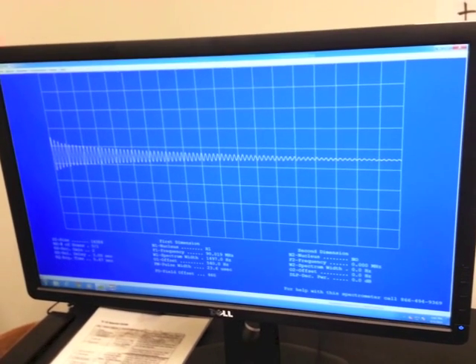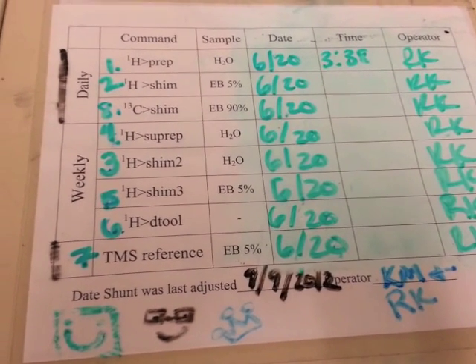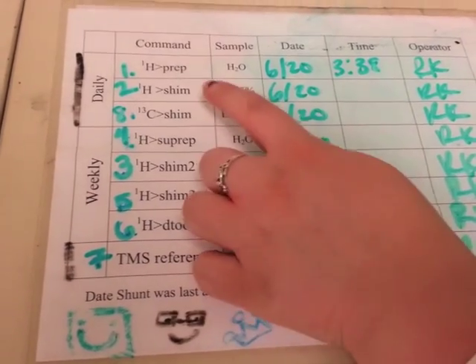Once the PREP routine is finished, the box in the top right corner of the screen will disappear. After PREP is finished, the next step is SHIM.